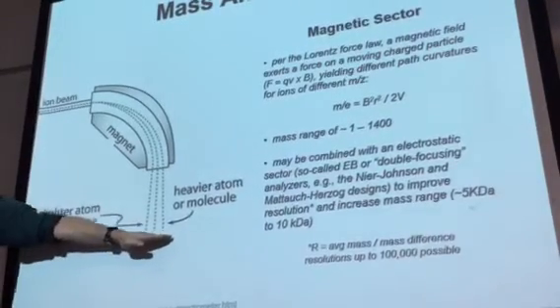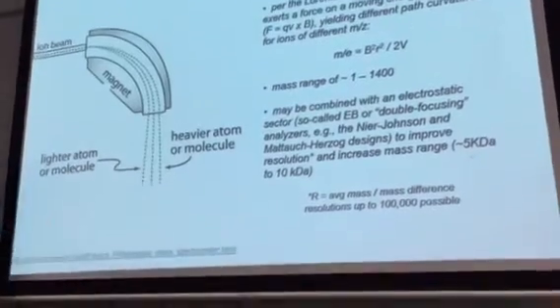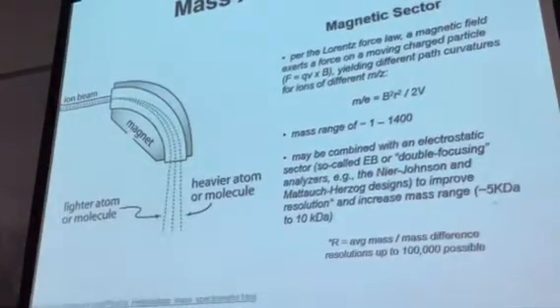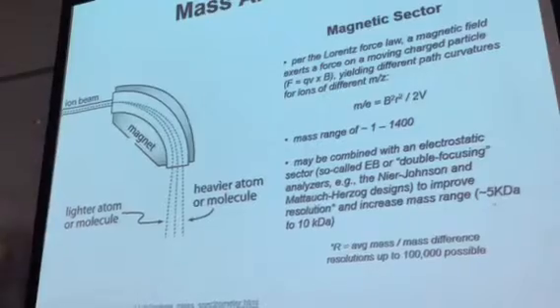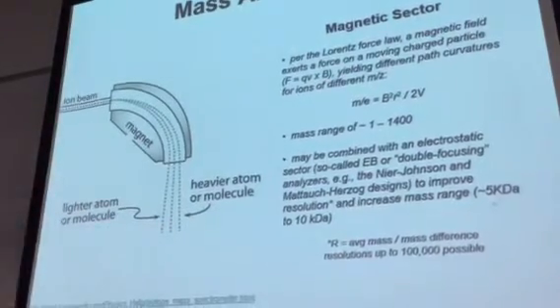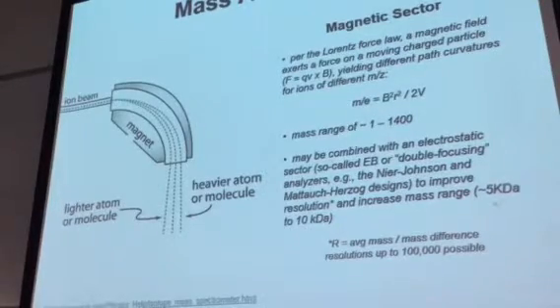Imagine you have some sort of a device here with a small slit through which only a certain mass to charge ratio or range of mass to charge ratios for the ions might actually be admitted to pass. Or you could have a planar array detector to detect all those simultaneously. But anyway, the important thing is this: the ions all traveling essentially not collinear, but all traveling parallel to one another. The paths all parallel. The paths are now no longer parallel, they're divergent. And again, the extent to which those paths are altered, given by that relationship right there.